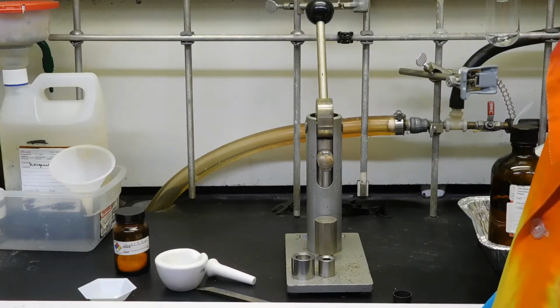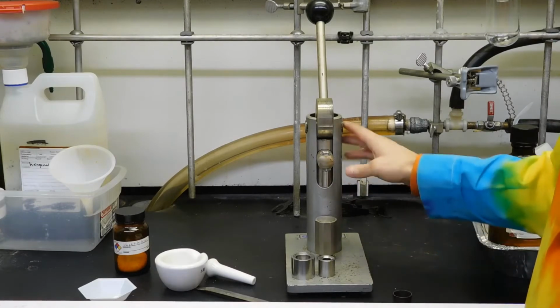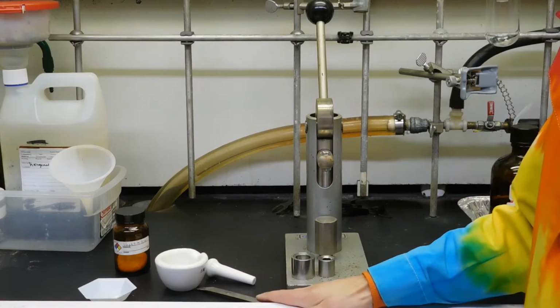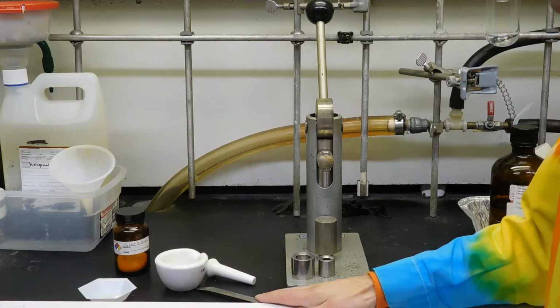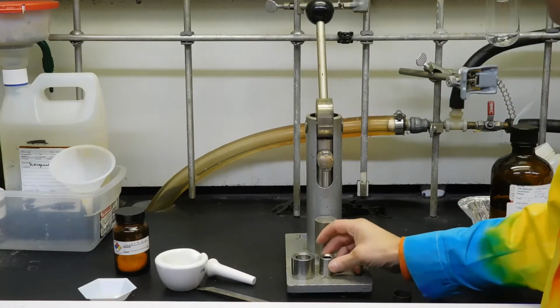So you can't see me, but this is Dr. Guto talking. What you're looking at here is the equipment for making a pellet for the bomb calorimeter. This is the press, and these are the parts for making the pellet.